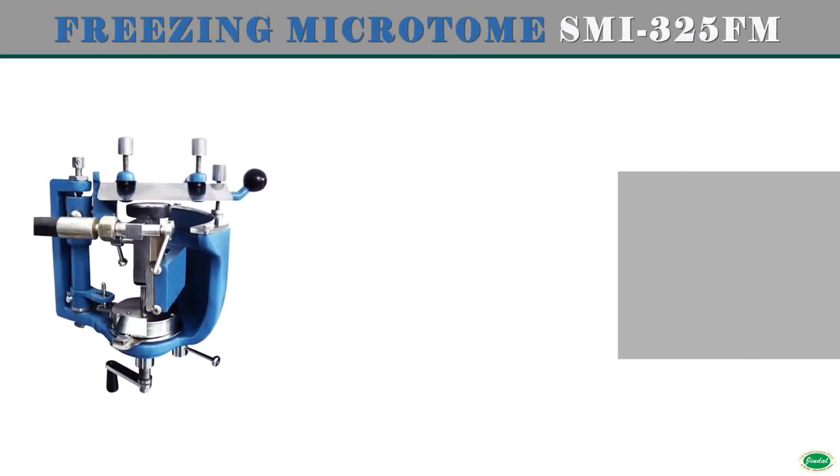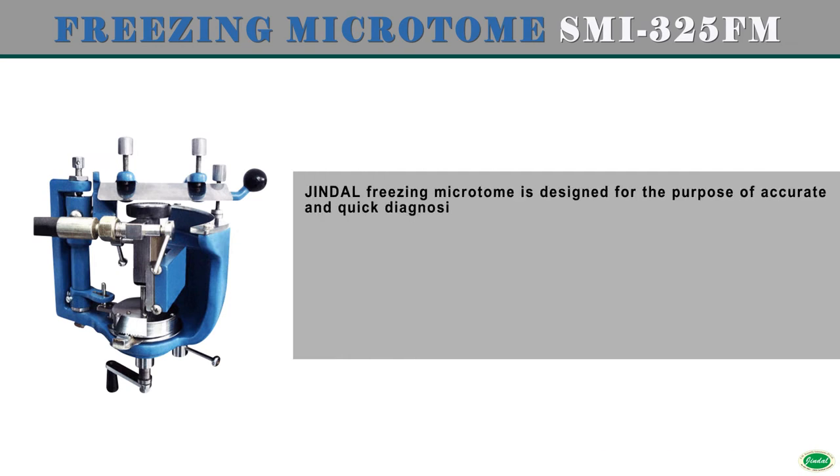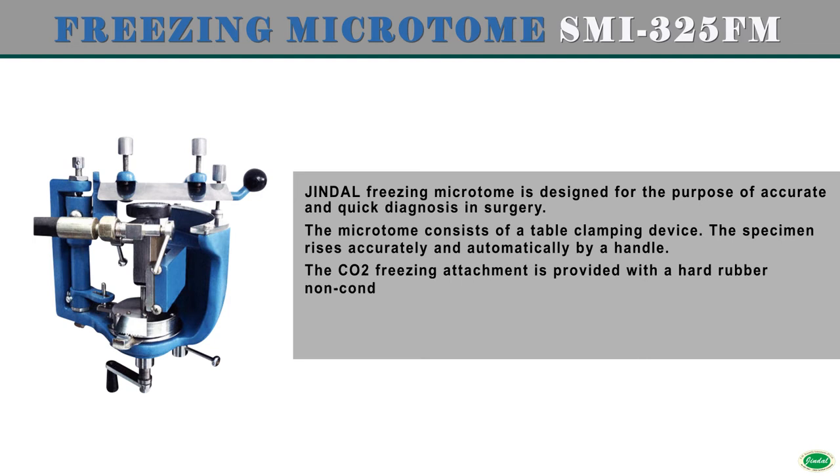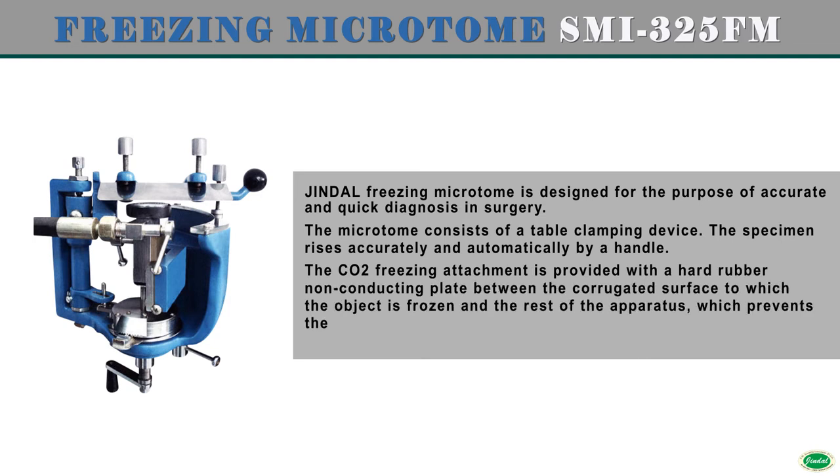Jindal Freezing Microtome is designed for the purpose of accurate and quick diagnosis in surgery. The microtome consists of a table clamping device. The specimen rises accurately and automatically by a handle.